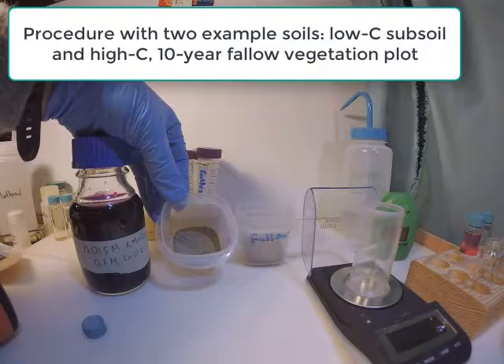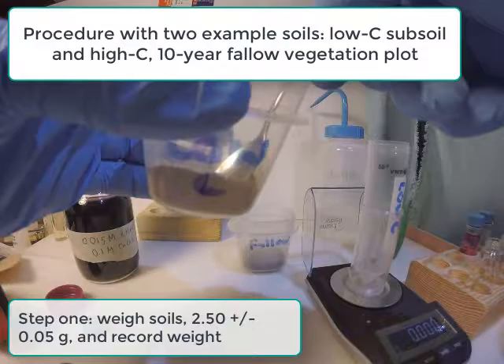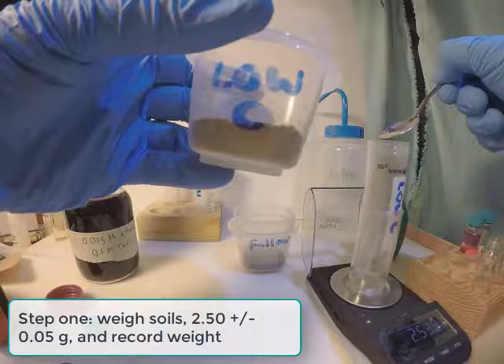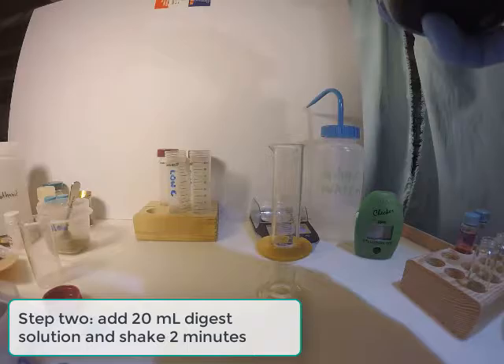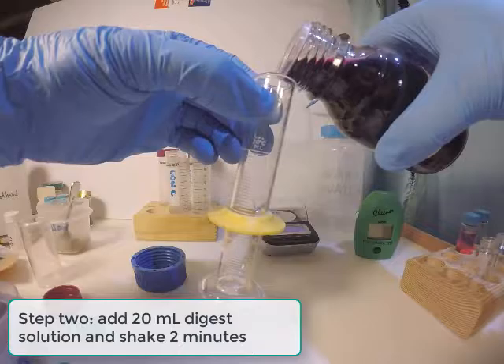We will now show you the procedure with two soils. One is a low-carbon subsoil; the other is a fallow soil which has had 10 years of fallow vegetation, so it should have much higher active carbon. The first step is to weigh 2.5 grams of soil into the digestion tube, to an accuracy of 0.05 grams, and record it on a datasheet. The second step is to add 20 milliliters of digestion solution with potassium permanganate to the tube and soil, then shake for 2 minutes. Here we use a graduated cylinder to measure out 20 milliliters of solution.